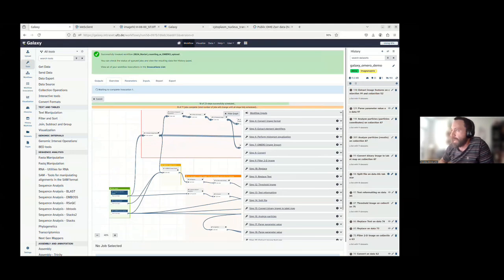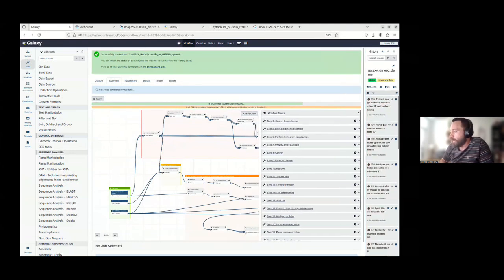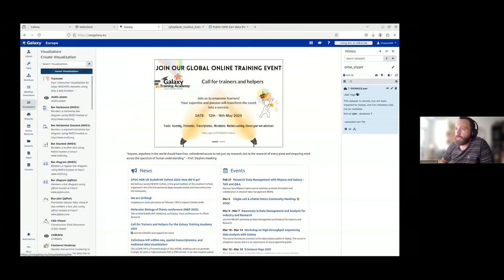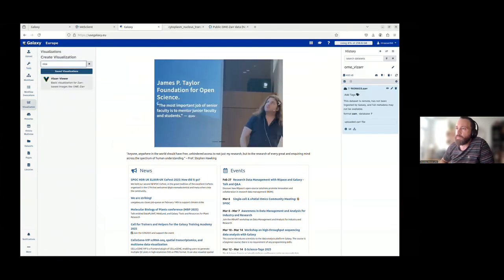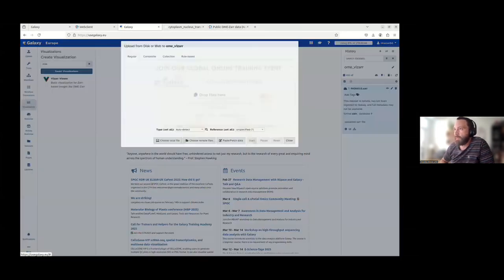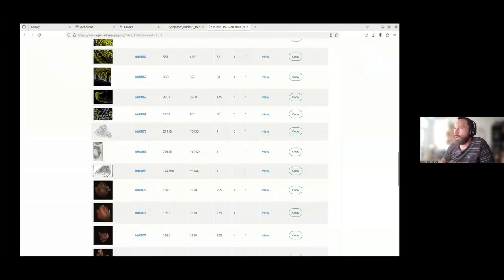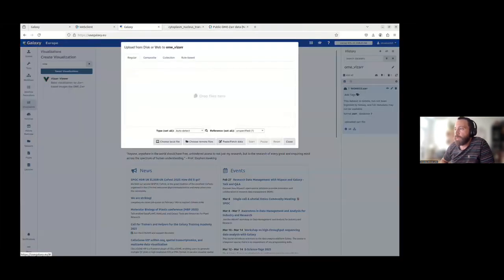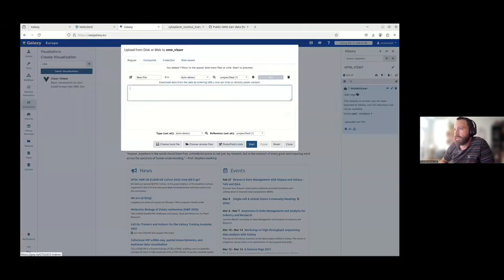This will take a bit of time, but not so long. In the meanwhile, I will show you how to visualize OME-Zarr using Galaxy. As I said, there is an interactive visualization tool called Vizarr. It allows you to visualize OME-Zarr files in Galaxy. What you need to do is take, for example, a link from public OME-Zarr data. We can take this one, IDR 0077, copy it, and then upload it by pasting or fetching remote data.